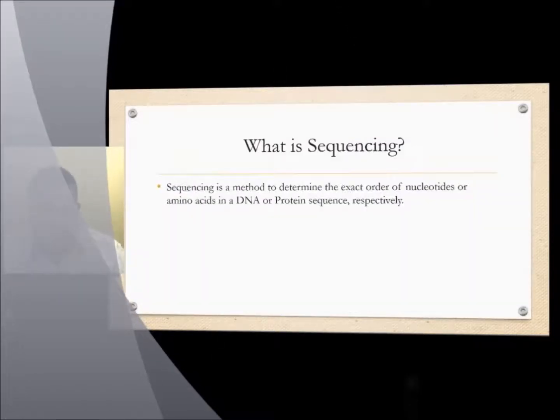And one of the first aspects of the bioinformatics of a genome is, and this particular class will go into maybe several modules, where we're going to start with the basic notions of how do you determine an unknown sequence. Okay, this whole notion of what is sequencing, to be able to say I can now extend that and I should be able to determine the sequence of a genome. And that is really the state of the art right now. It is this notion of next generation sequencing.